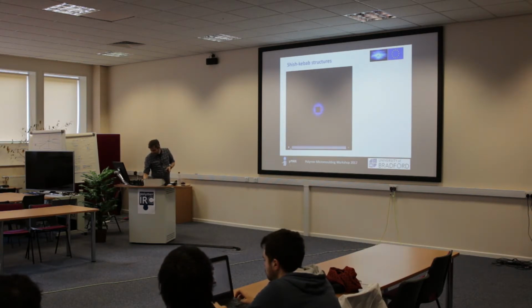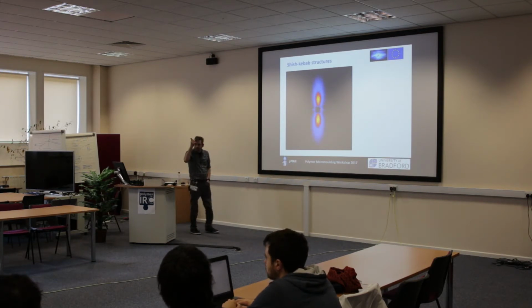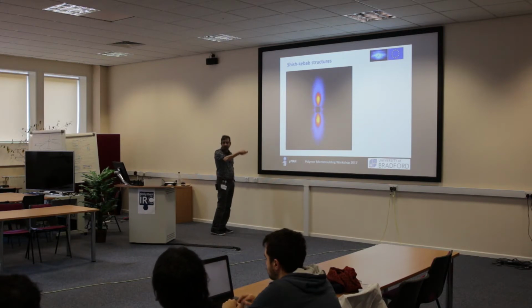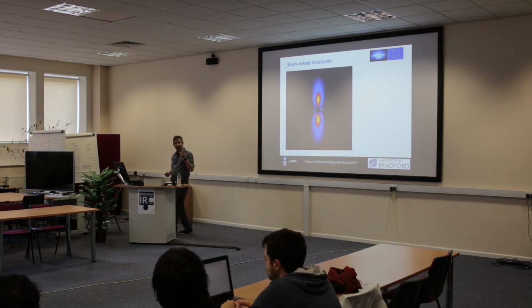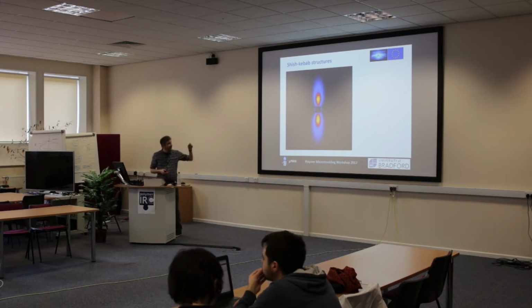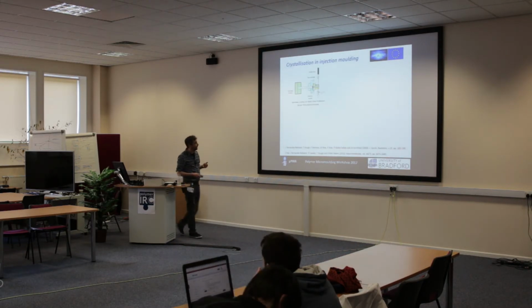I'm ambitiously going to play a video. And this is what happens. This is tracking that haul-off at 0.001 seconds. What you see is this main oriented structure, but you can also see a structure going the other direction. So this is one of the first observations of that shish kebab structure actually forming. The fact that you've got these orthogonal crystallization directions occurring, you can actually see it using these techniques. And then you can begin to study how they form and why they form.